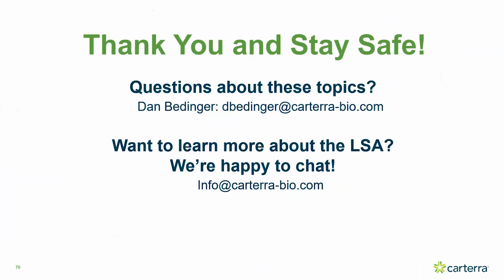The other option is you can control the way you create your capture surface so that it doesn't have the capacity to bind really large amounts of antibodies in the first place. Very often that's an approach people need to use if they have large numbers of crude samples that vary widely in concentration. You can create a less dense capture surface and then try to flow for a long time so that you achieve more of a saturation of that surface and can have a more comparable and uniform binding level of the antibodies across the array.